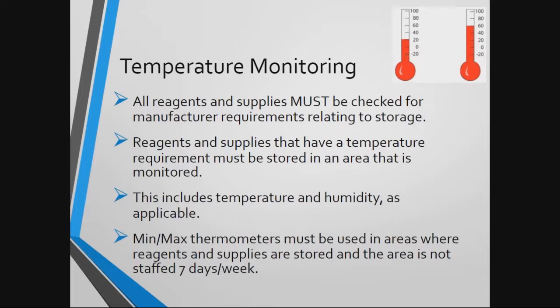In the case where reagents and supplies that require temperature monitoring are stored in an area that is not staffed 7 days a week, it is imperative to have minimum and maximum thermometers so as to ensure that the temperature did not fall out of range when the staff was not present. Additionally, there must be documentation that the min-max temperatures are checked when staff return.